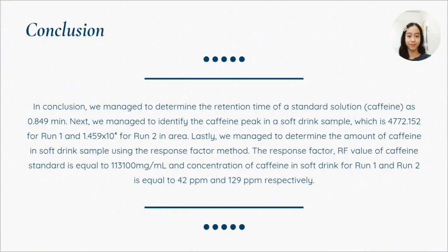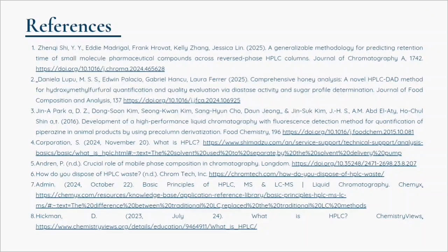The response factor, RF, value of the caffeine standard is equal to 113,100 mg per milliliter, and the concentration of caffeine in soft drink for run 1 and run 2 is equal to 42 ppm and 129 ppm respectively.